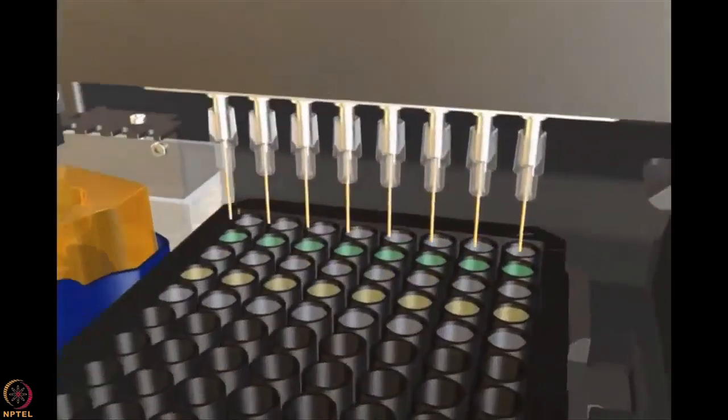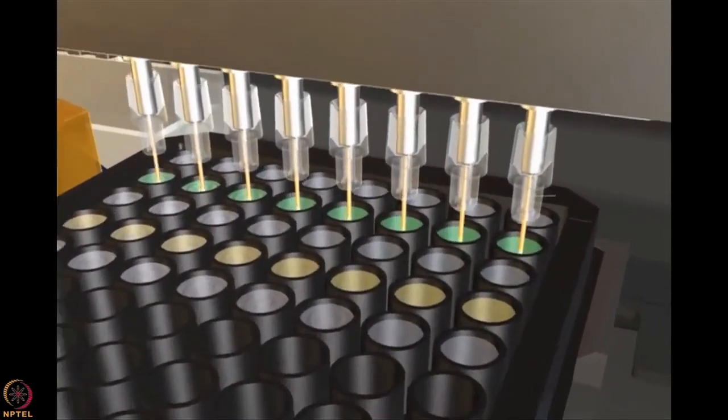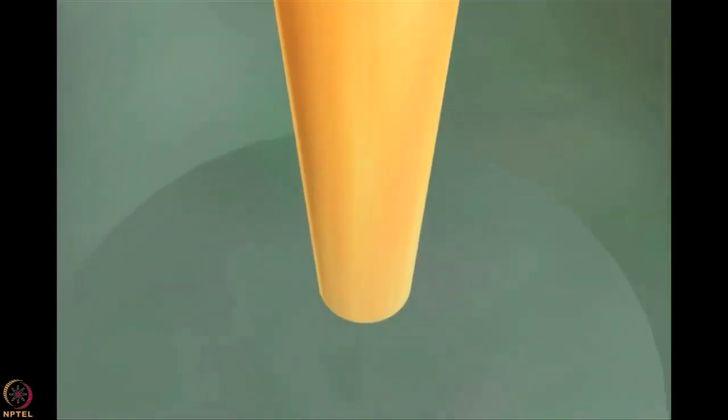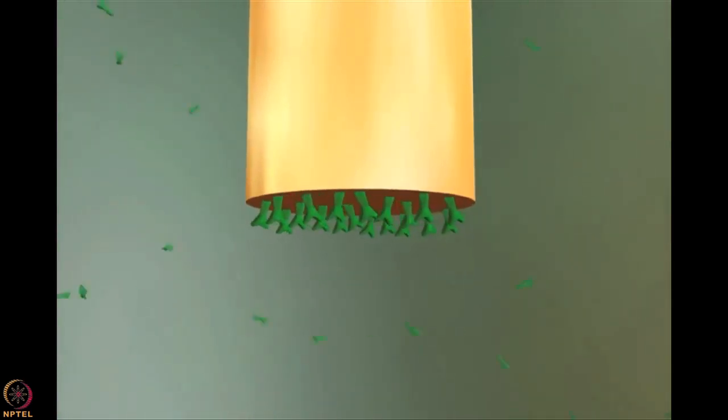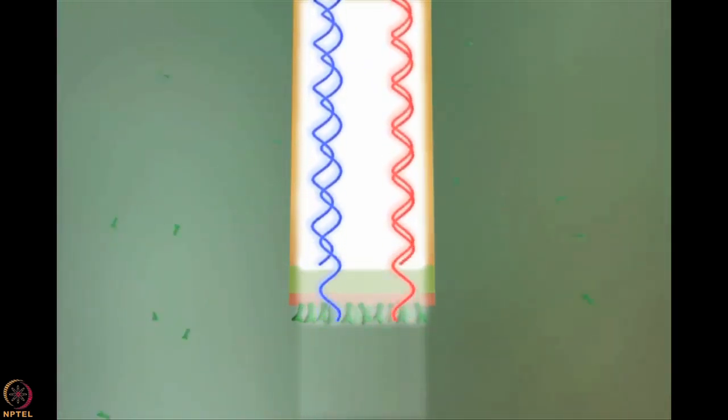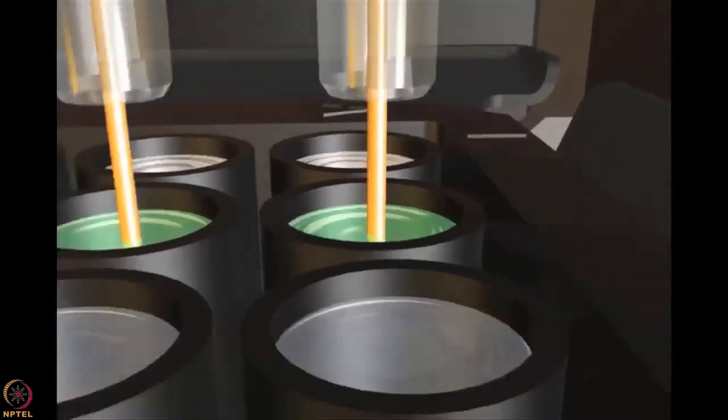The streptavidin sensors are loaded by transferring into the wells with biotinylated protein. Biolayer interferometry is insensitive to changes in refractive index or pH of the matrix. When more molecules bind to the streptavidin layer, the optical thickness of the layer changes. And as the thickness changes, the interference pattern shifts.